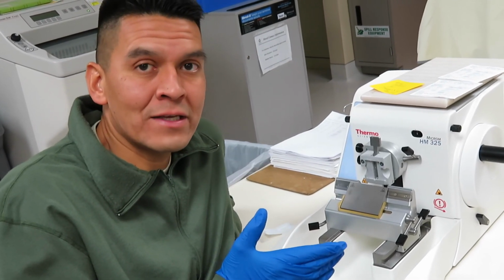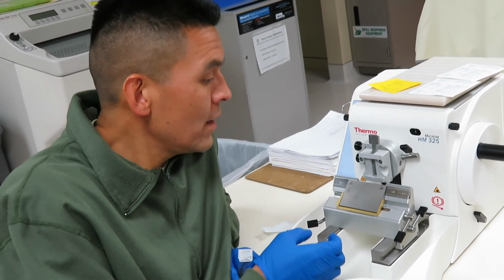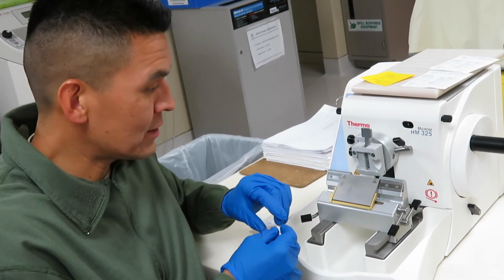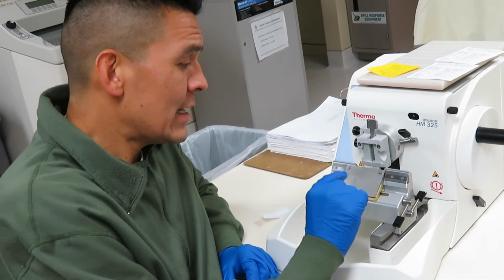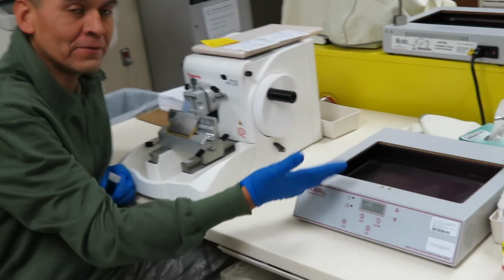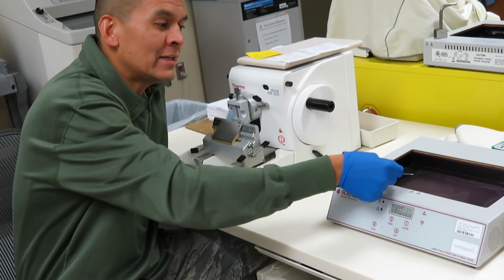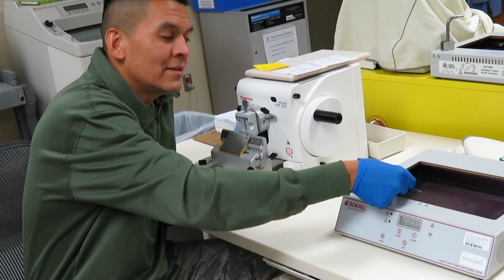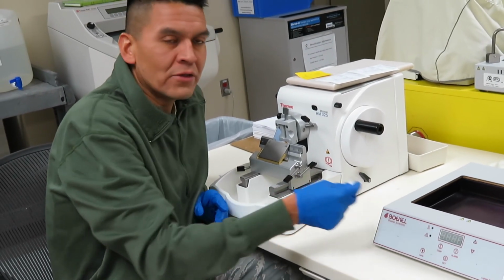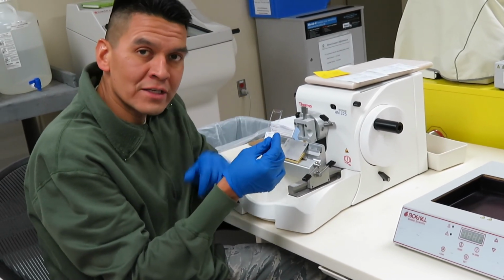So it gets every cellular detail. It'll cut through all the cells, and so that way we can see it under the microscope. Anyways, once that wafer comes off right here, they get that little wafer, if you will, and put it in a water bath and it floats on the water bath. Then they get an empty slide, and they just bring it up into the tissue wafer. The wax dissolves and the tissue adheres or sticks to the slide.